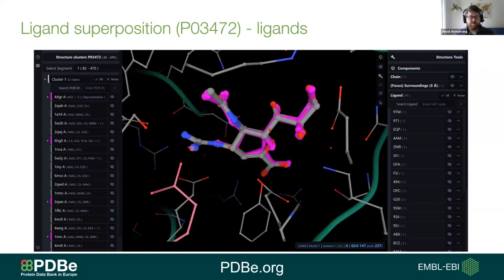So we can use this view to look a little bit more around the structure and generally get an idea of the difference between interactions with one amino acid and the other. The only issue with this view for doing that is that the protein structure that's displayed is only one representative structure. So you won't be able to see individual differences between specific ligands in that case. So in order to do that, we maybe want to look at a more specific example and interpret it in a bit more detail.